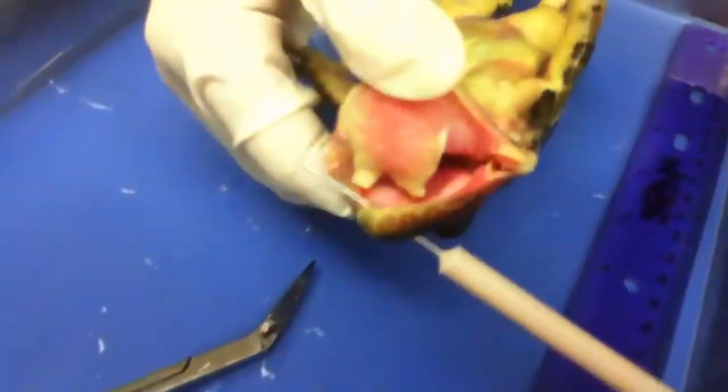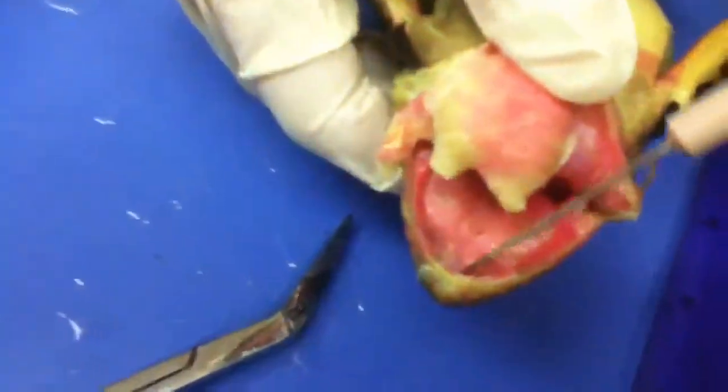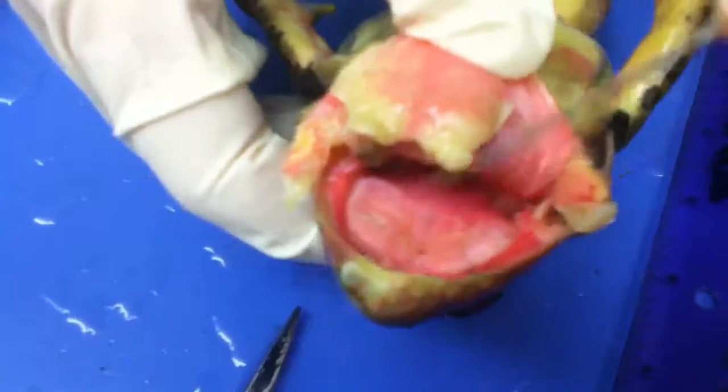Now, you can see when you start cutting, you want to cut up past this point here. Look, you want to cut up past this point, so you have to break that bone when you cut past the bone. Okay, go back to your thing. Okay, our mouth is done.